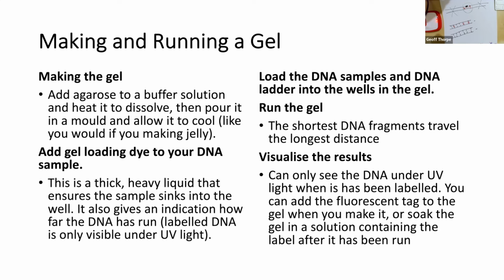The next thing is we want to add a gel loading dye to your DNA sample. This does two things. It's a thick, heavy liquid that makes sure your sample sinks down into the well, because remember, the well is completely submerged in the buffer. We don't want it to all just dissolve and float away. So that makes sure that our DNA sample sinks down into the well.